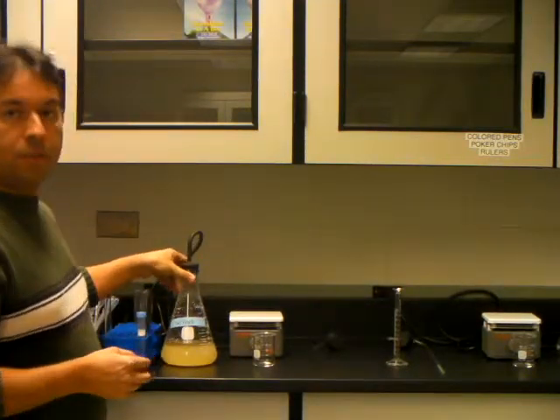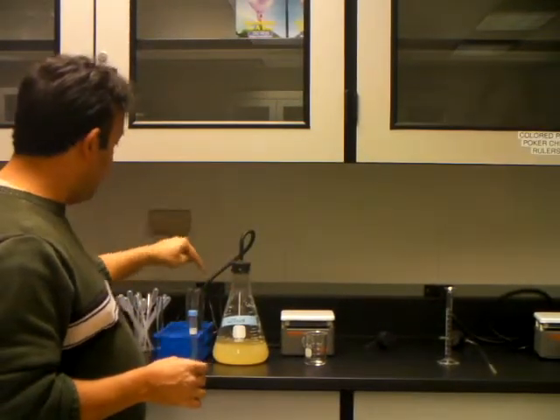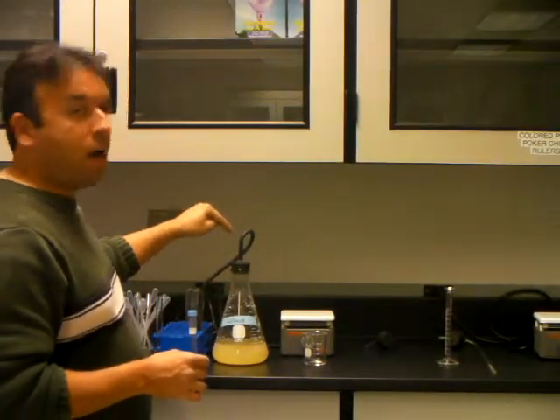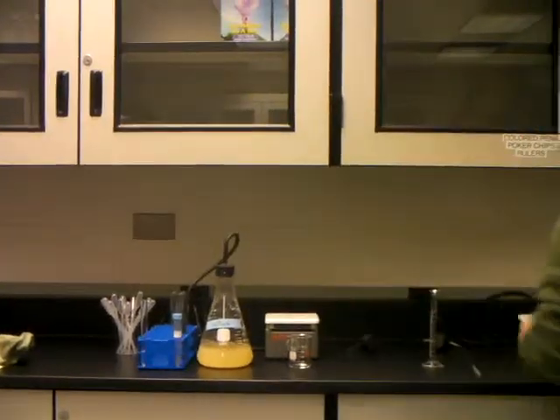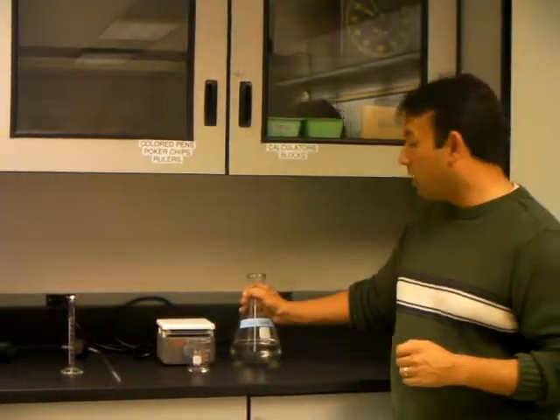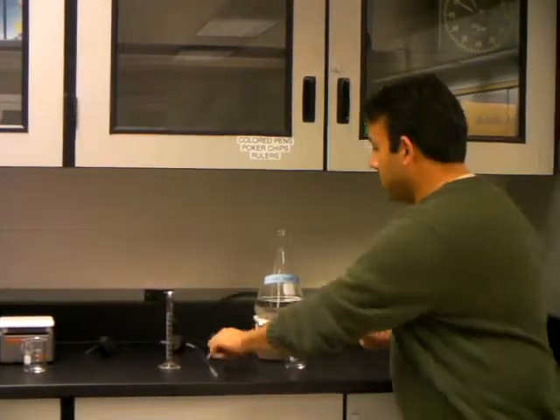Here you have yeast with cornstarch and a little bit of water, and you'll notice that we've put the system in a way that no oxygen could get into this beaker. Over here, we have just yeast with cornstarch, and what we're going to do is we're going to assemble our system this way.